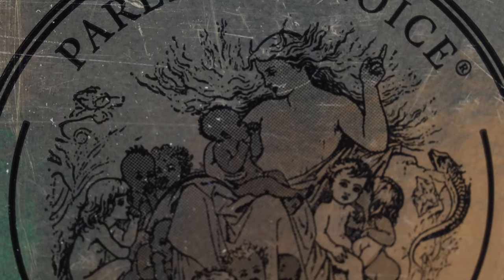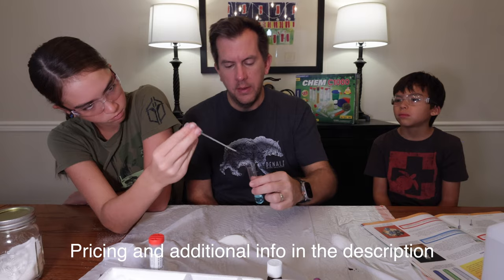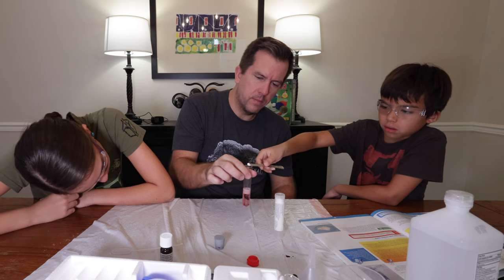Now, is it me or is the drawing on that award a little bit creepy? During the video, my kids and I will perform four of the experiments to give you an idea of what this kit is all about. So to start off, let's take a look at what comes inside the box.